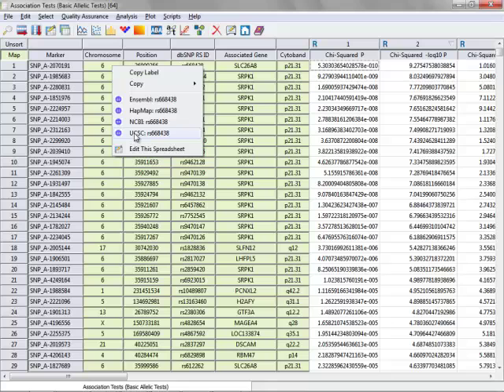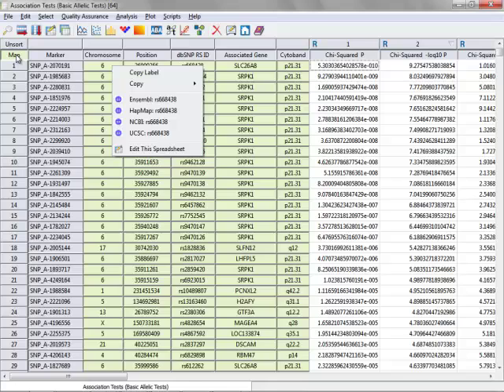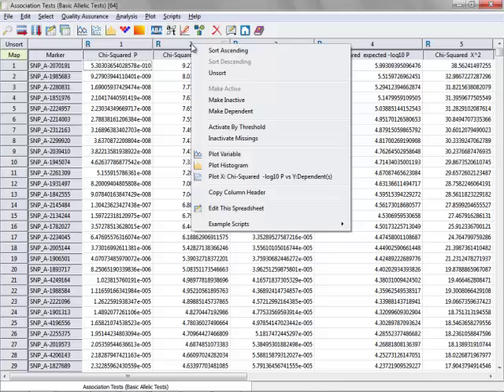Now beyond visualizing your results in a spreadsheet, you can also visualize them in a genome browser in what's referred to as a Manhattan plot. To do this, let's go ahead and click this map button again to hide the marker map information. Then you right-click on the chi-squared negative log 10p column and click Plot Variable.